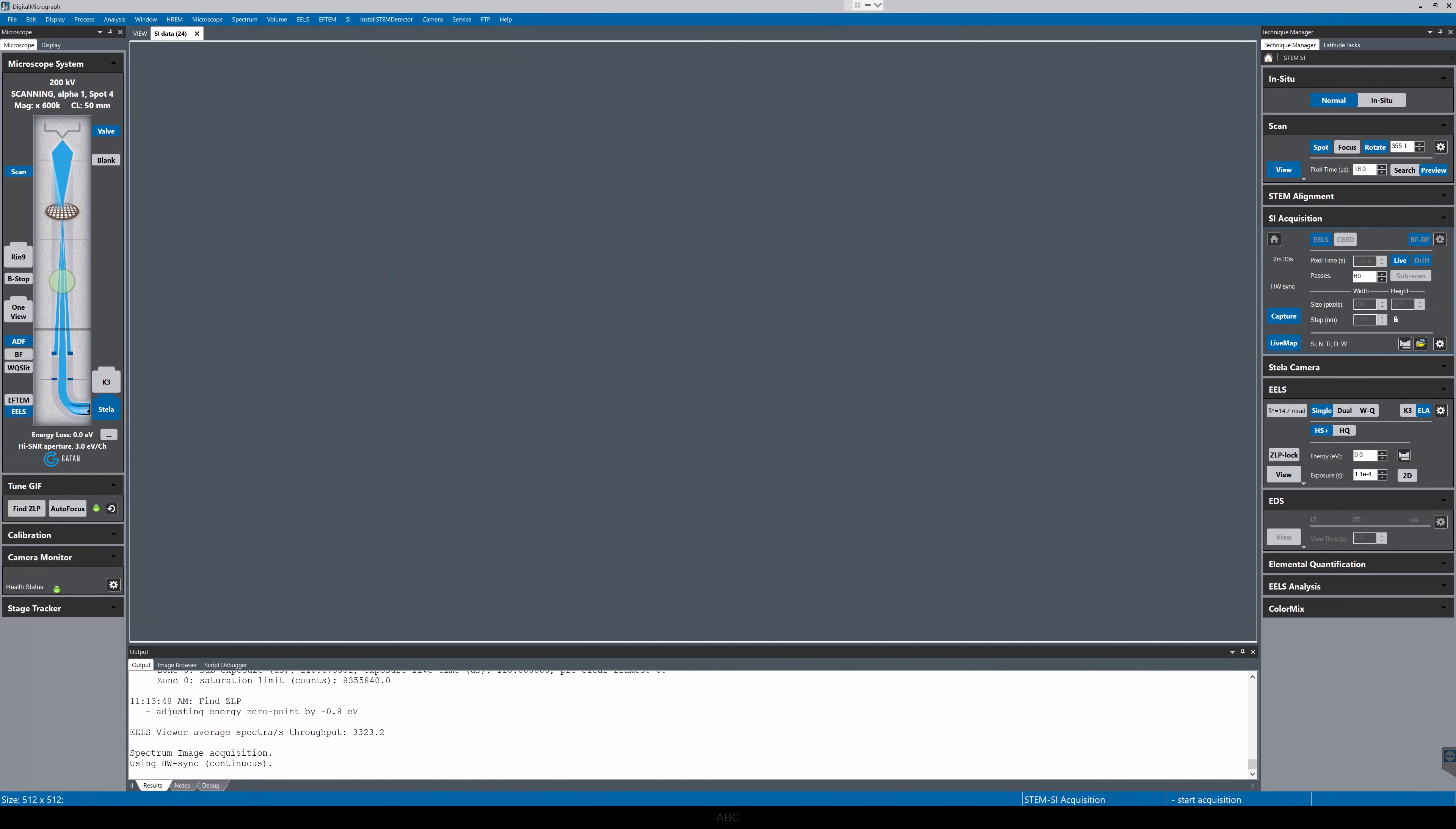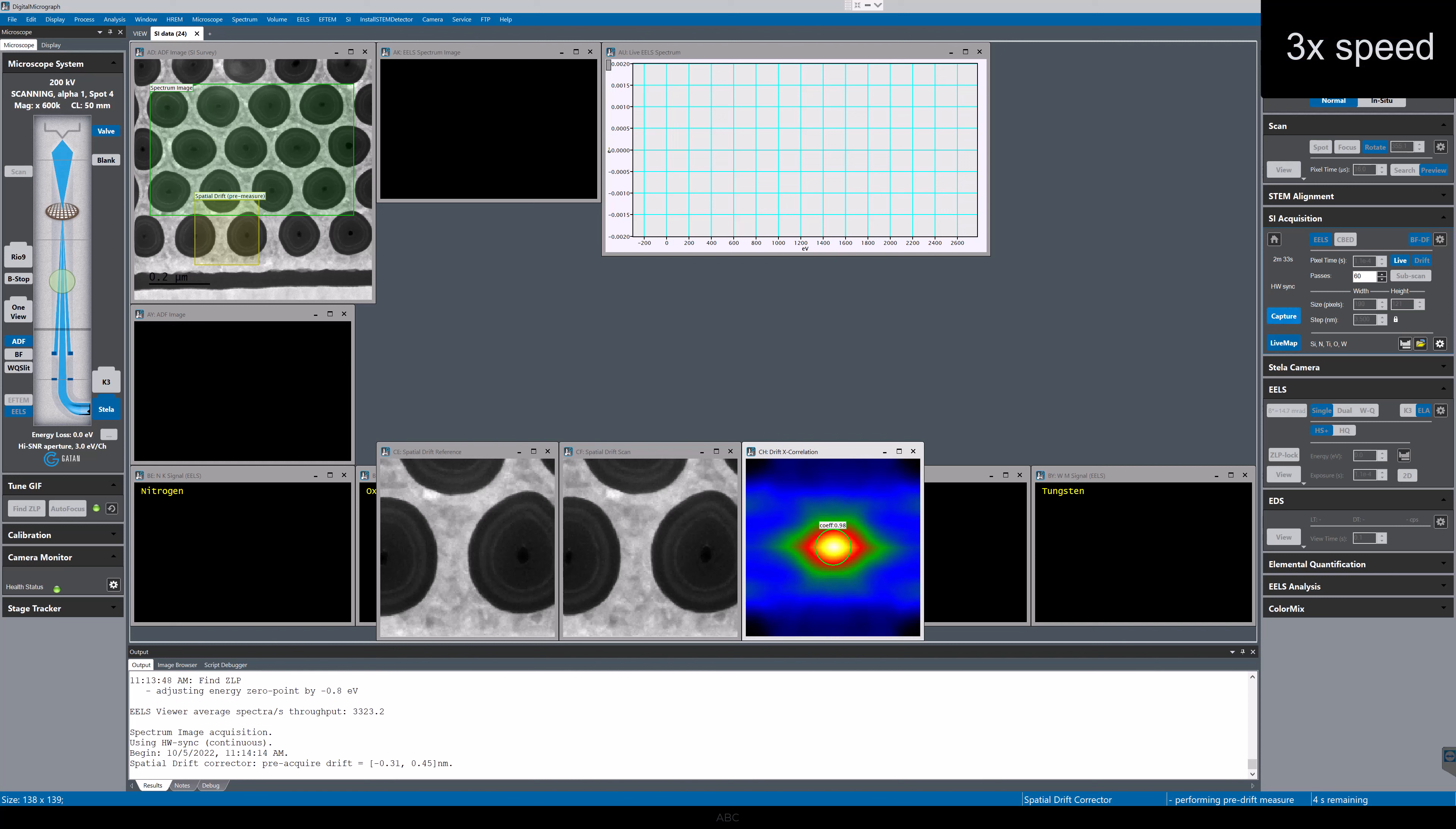The software makes an initial drift measurement. Once that is complete, it begins to capture the spectrum image data.